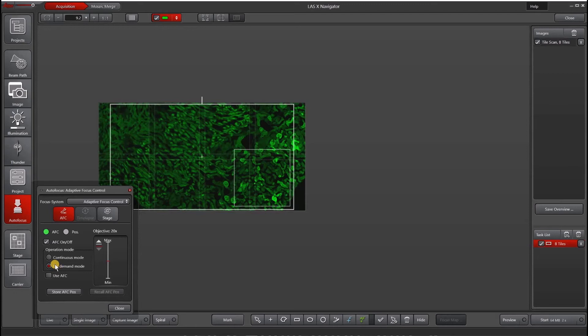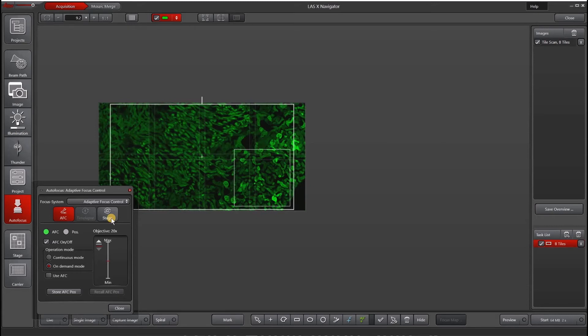If you're doing multi-position or time-lapse experiments, then you will also have access to these two buttons here, time-lapse and stage, where you can execute AFC on-demand for specific positions or all positions or time points.